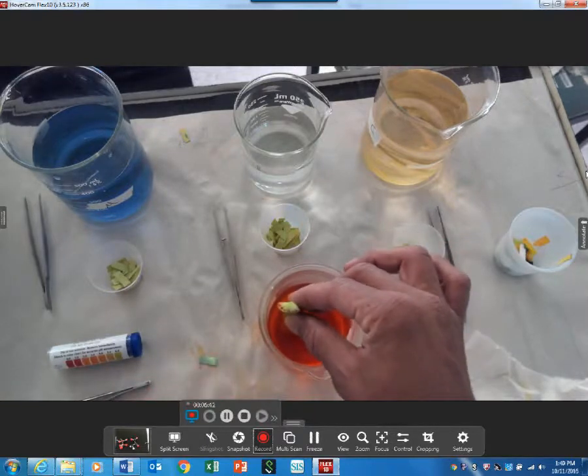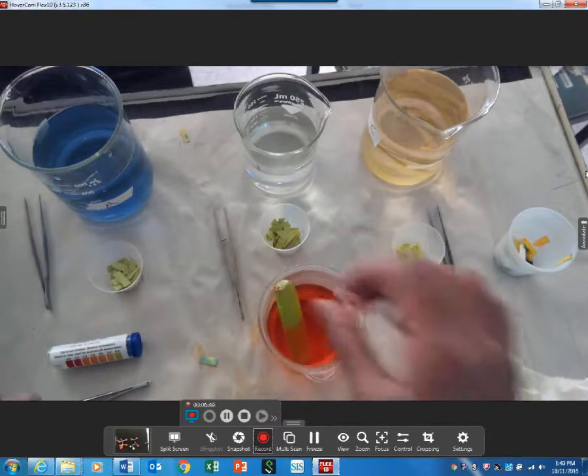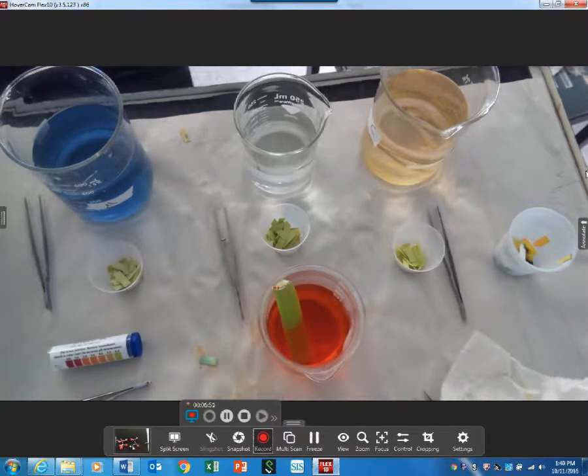That's this. On your future quiz, we're going to expect any of these scenarios to be a picture for you to describe. For example, let's talk about one other idea that we want to demonstrate, and that's going to be back on this cart.